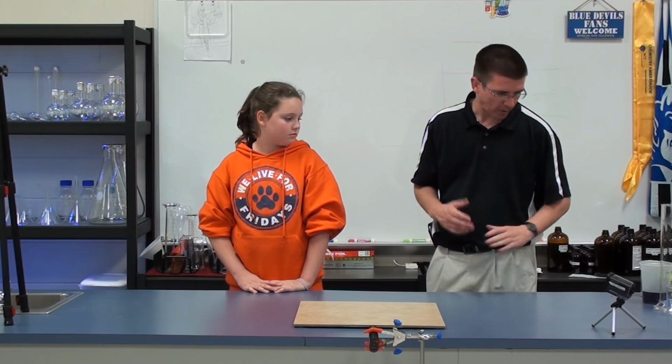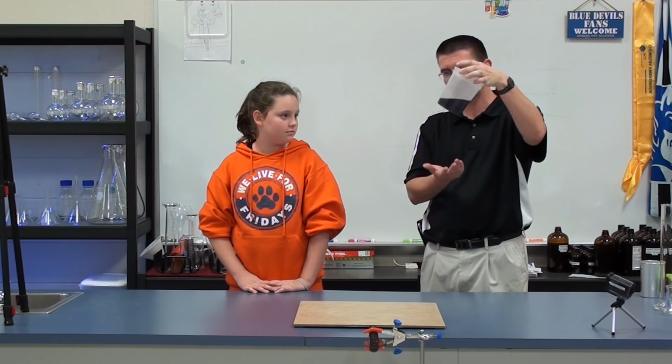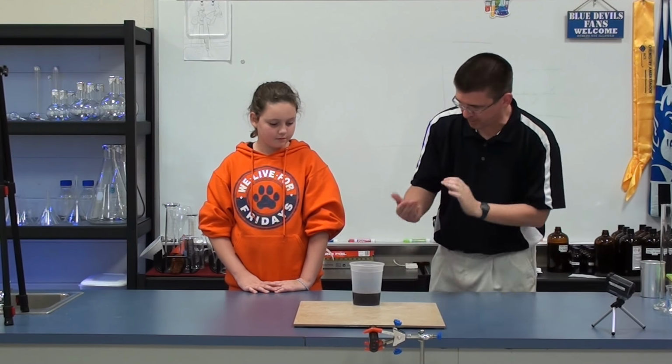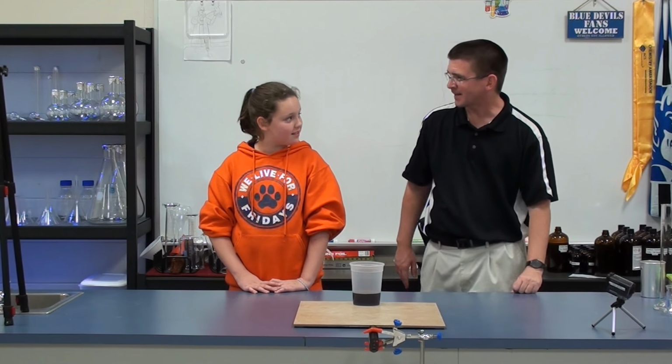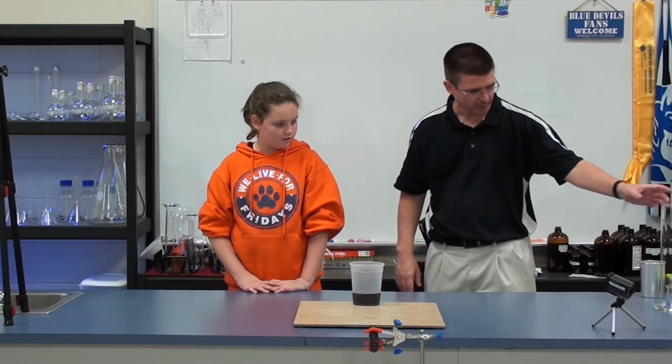And I know probably if I gave you a cup of liquid here and said how much liquid is that, we'd have a hard time just looking at that and telling, wouldn't we? But do we have a piece of equipment that we could use that would help us know how much we have in there? Graduated cylinders? Right, graduated cylinders. We use those for volume measurement if we're measuring a liquid.